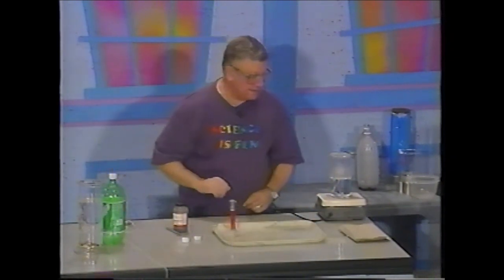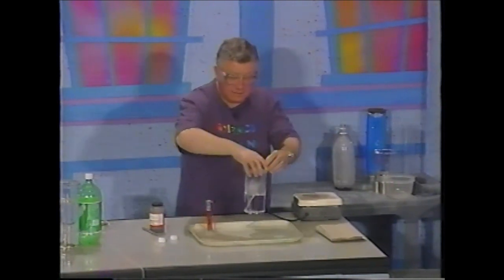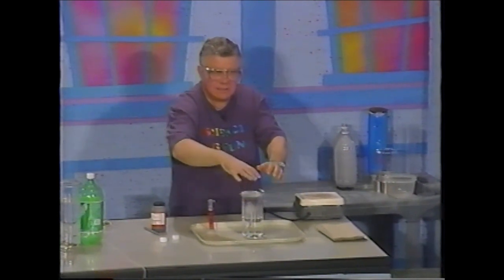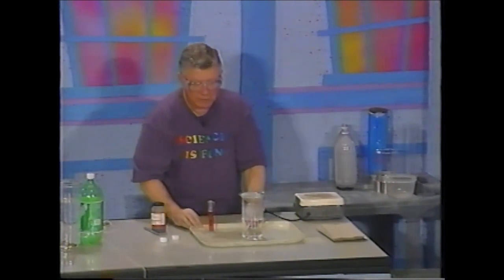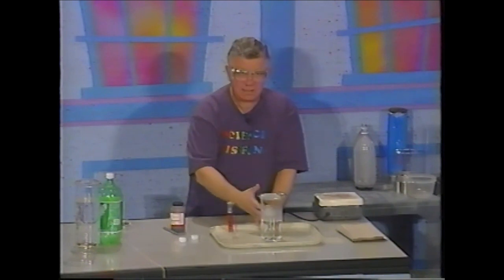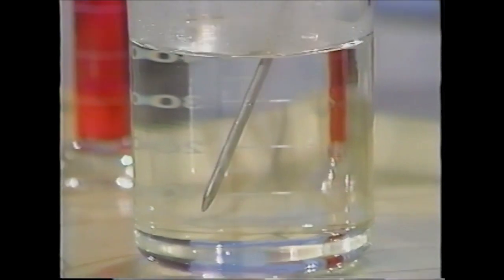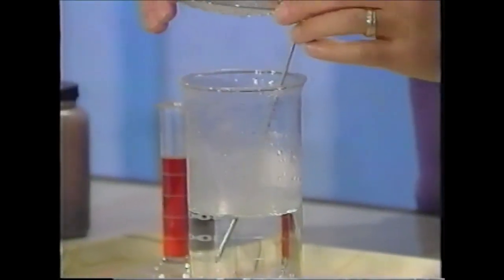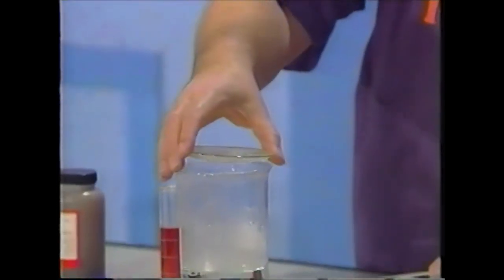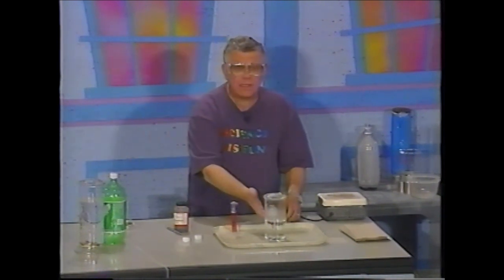Now what I want to do is take this beaker that has in it a clear and colorless liquid, and I'll tell you that this liquid is a mixture of a solution of something we call potassium tartarate and also hydrogen peroxide. They have been mixed together and heated to a temperature. Let me read. I have a temperature measuring device here. It's about 72 degrees. And a chemical reaction takes place between the hydrogen peroxide and the potassium tartarate, but it doesn't seem to be going.